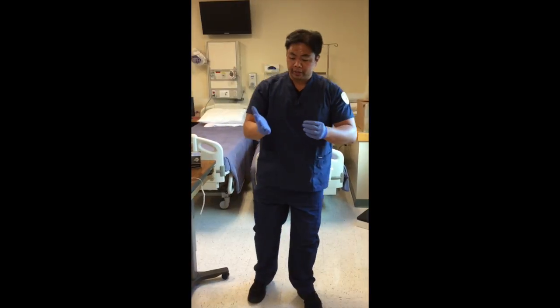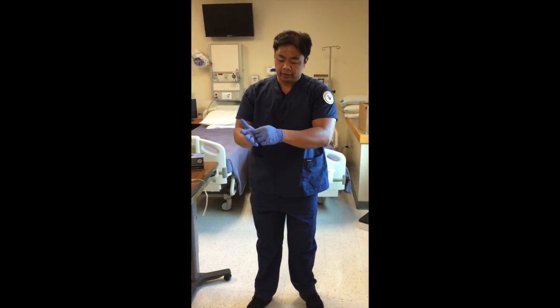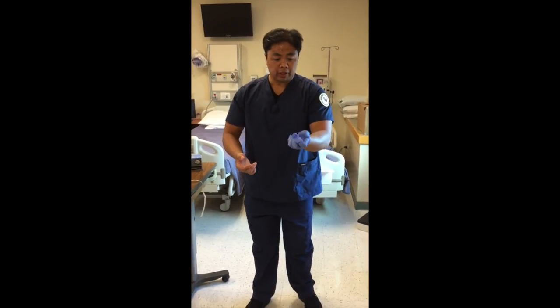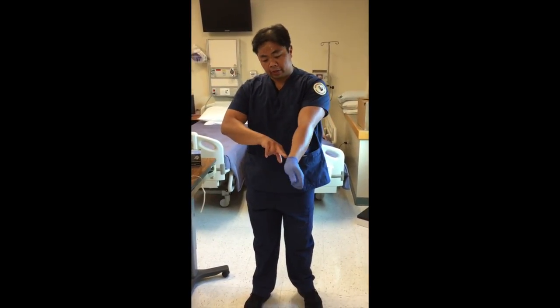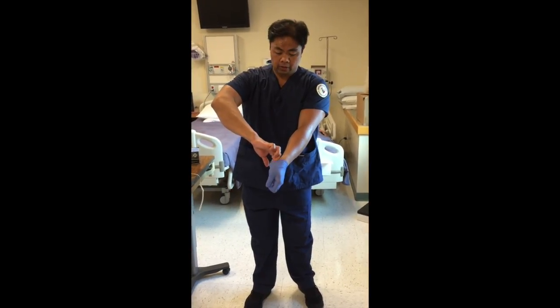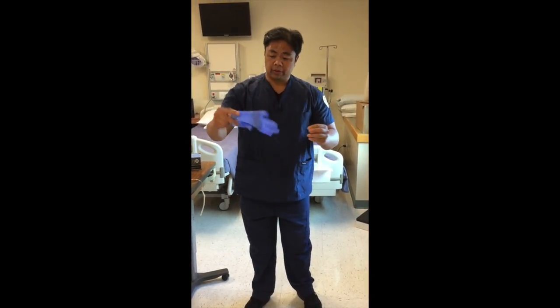The way you would take your glove off is that you would pinch this here and pull that, then you ball it up right here, then using two fingers go on the inside of the glove so you don't contaminate yourself. Pull it off like that and throw it away.